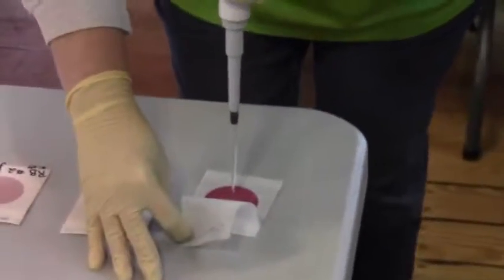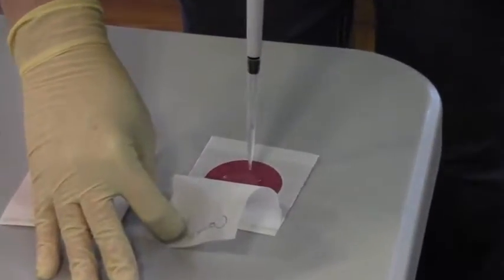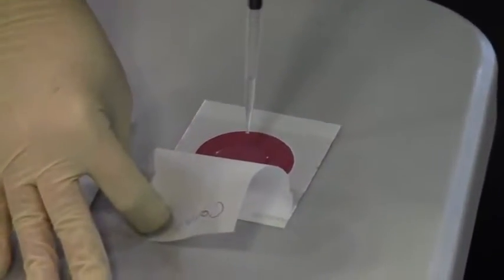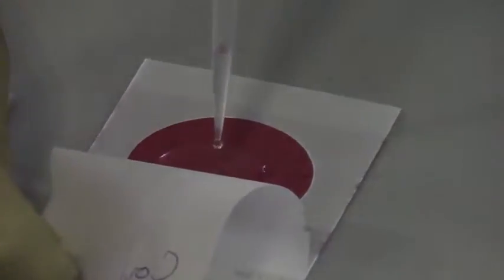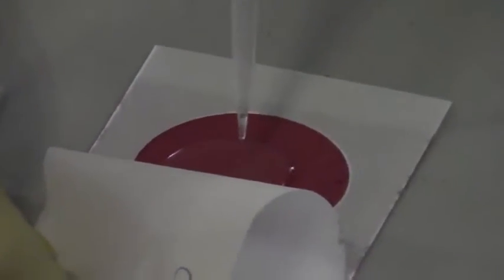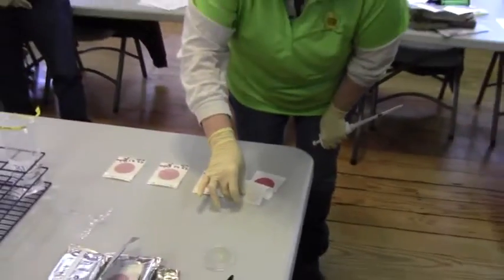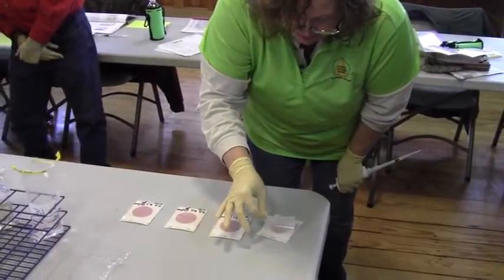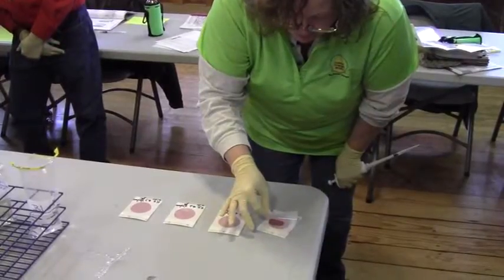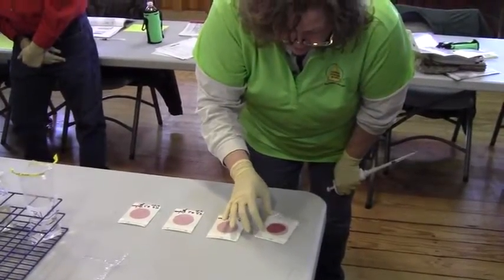You're going to expel the entire portion of water — the entire portion. Now that's the first stop, and then we push it again to get the rest out. Then we very, very slowly take this and put it down, and what we don't want is air bubbles.